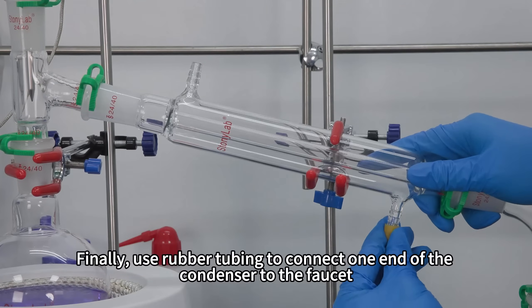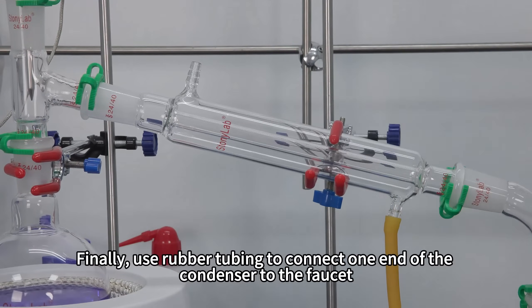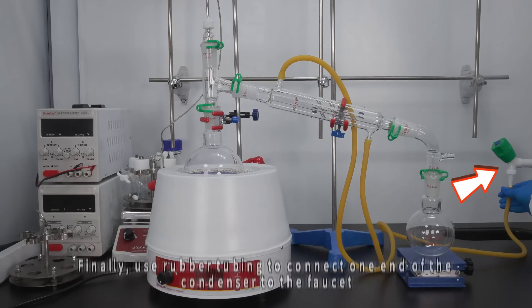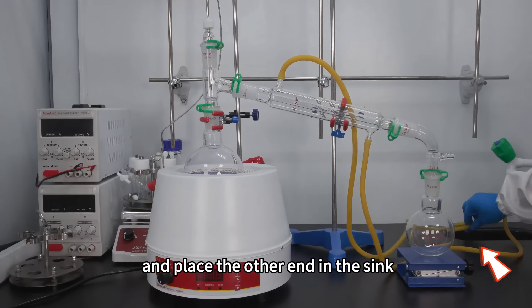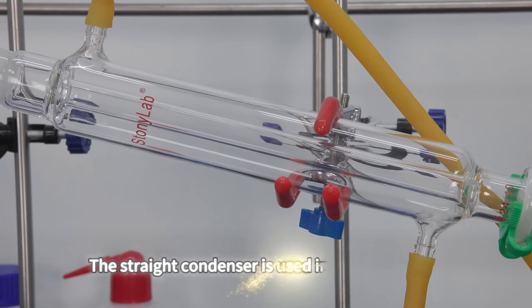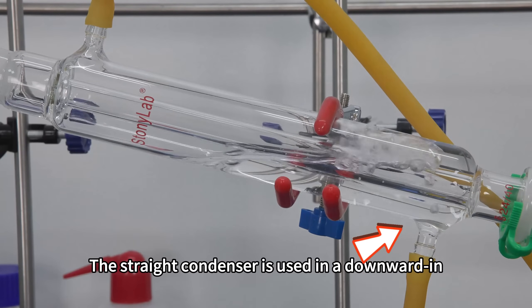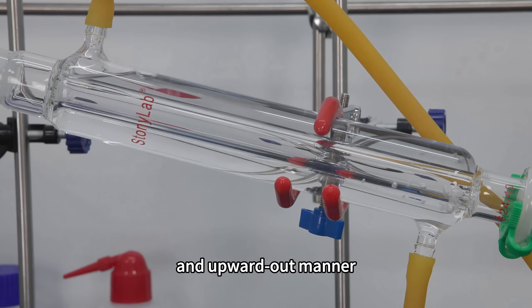Finally, use rubber tubing to connect one end of the condenser to the faucet and place the other end in the sink. The straight condenser is used in a downward-in, upward-out manner.